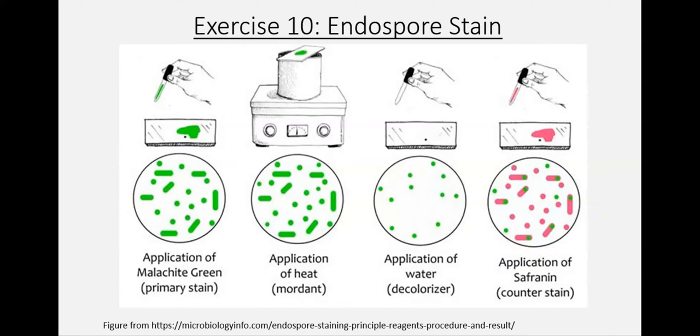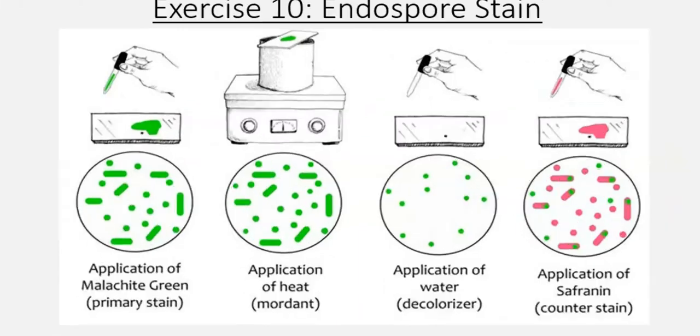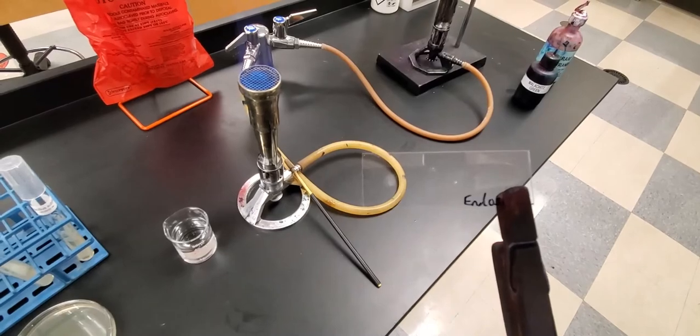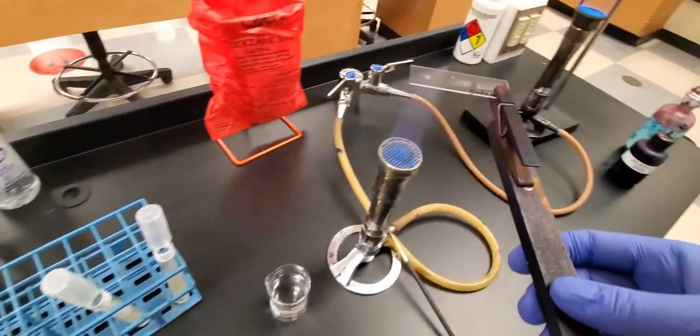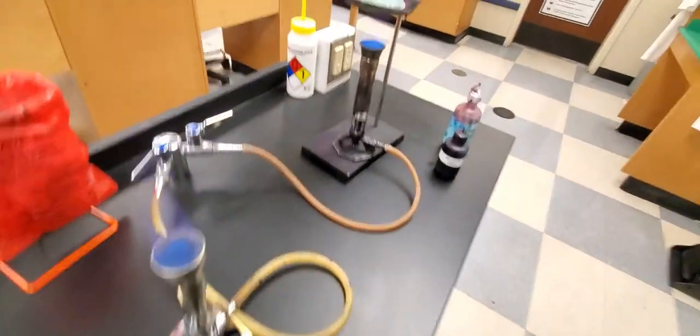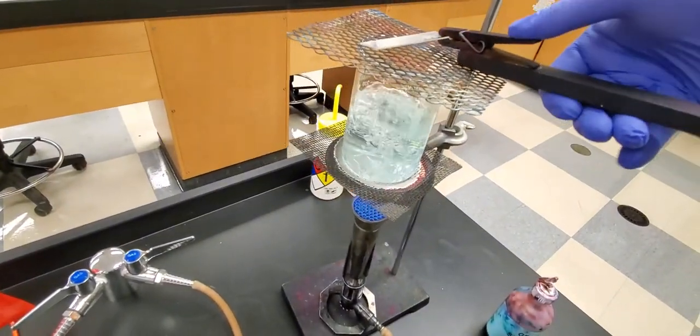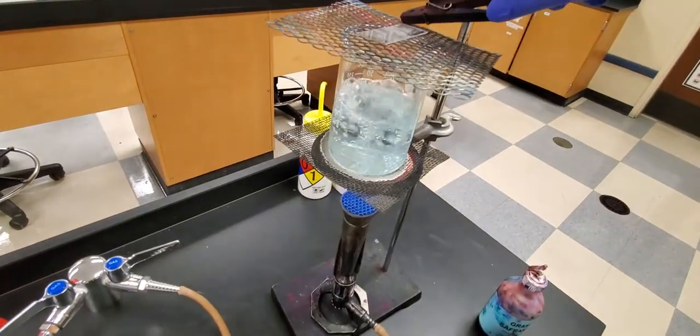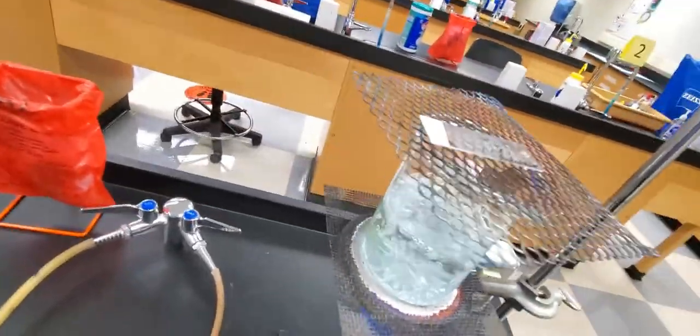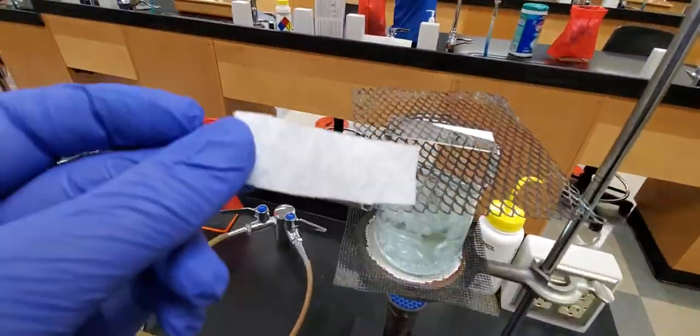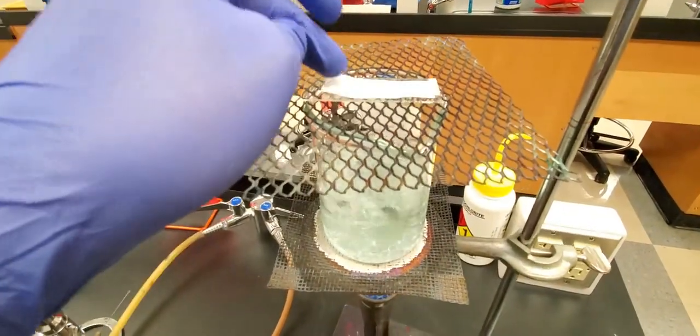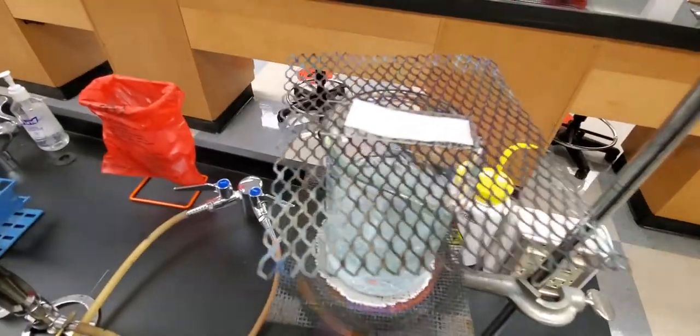Now that the smears have dried up, I'm going to just pass them through the flame one, two, three to do that heat fixing to hold them on there. Then we're going to take them and put them over this boiling water bath to give it a little bit of heat here. We will use a very high-tech piece of equipment known as a cut-up paper towel and place it right on top.